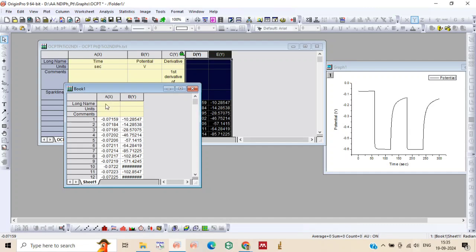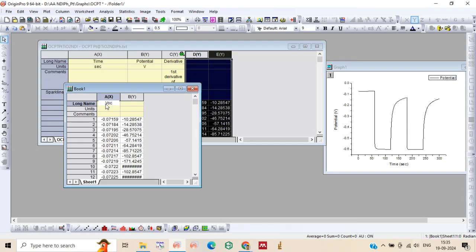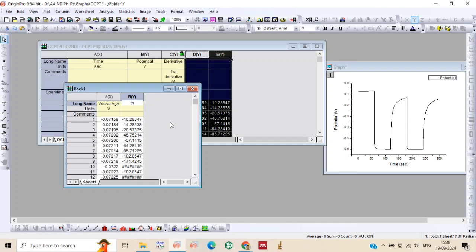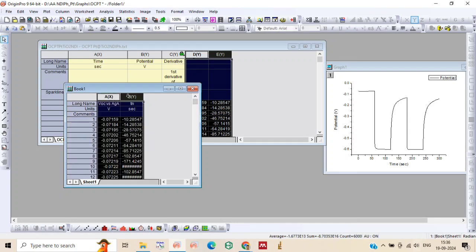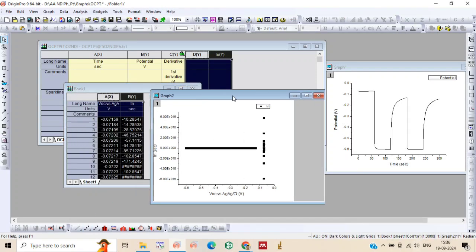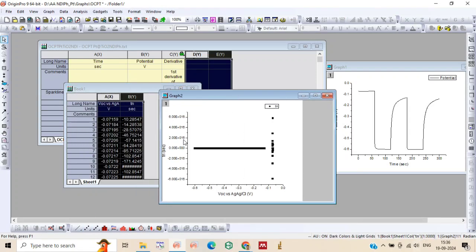Now just select both the columns. You can put here values. That is x-axis and y-axis. The y-axis is electron lifetime in seconds. Now drag it and take this point plot.